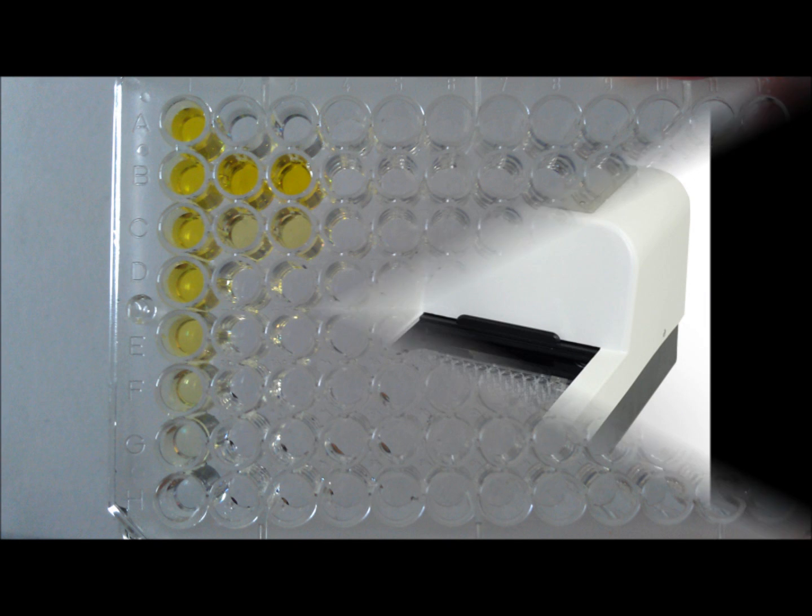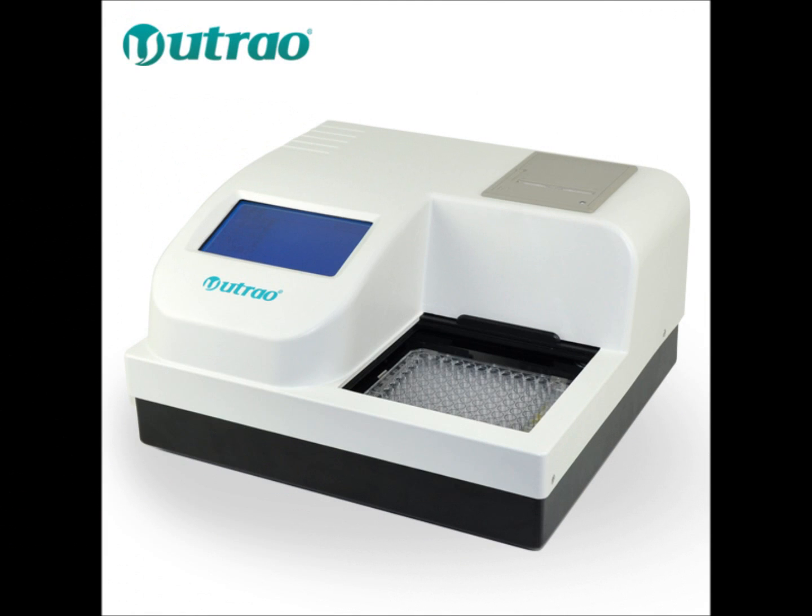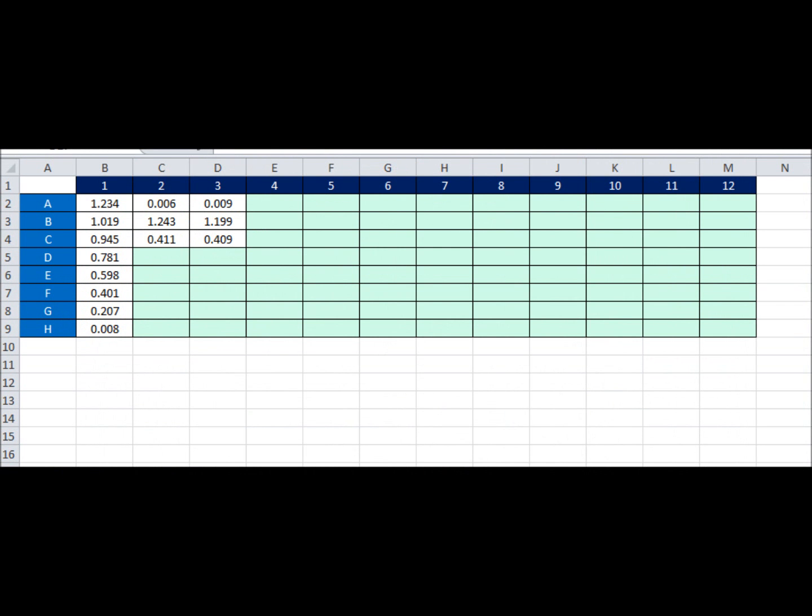To be more accurate, the ELISA plate is placed on an ELISA reader which is set to an absorbance reading value of 450 nanometers. Solid numeric results are given and analyzed on Excel.